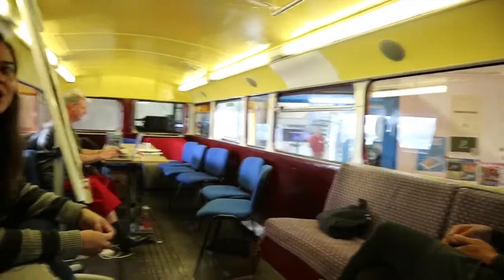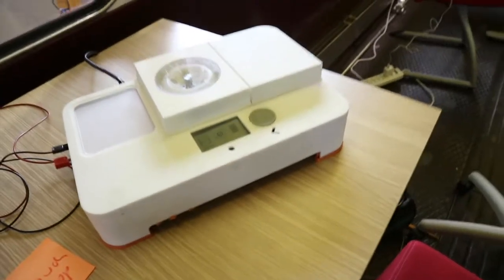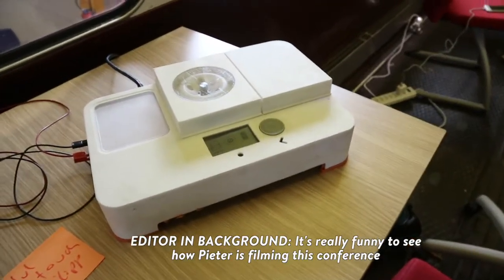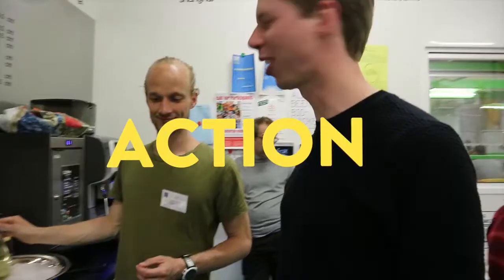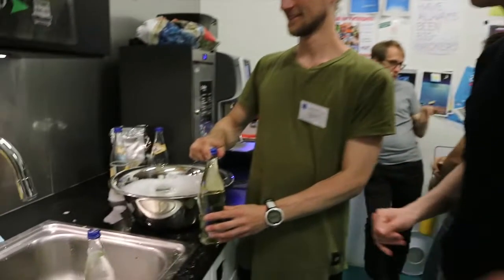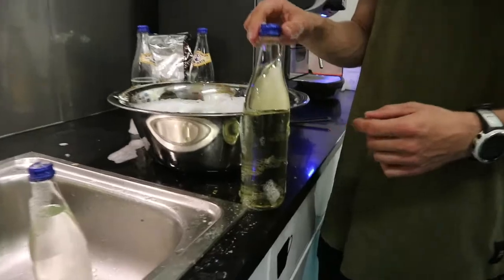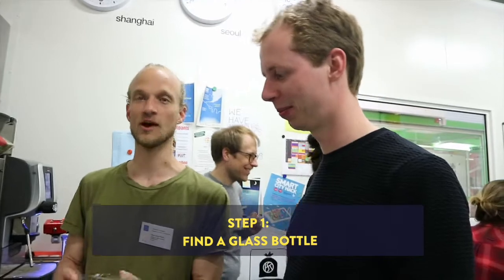Hello everybody in the bus. Hello. Would you like to be on the internet? This is the bento lab. So we had a little tour and now it's time for some action. We're going to extract hormones from urine and for that we need some bottles, so we need to prepare them.